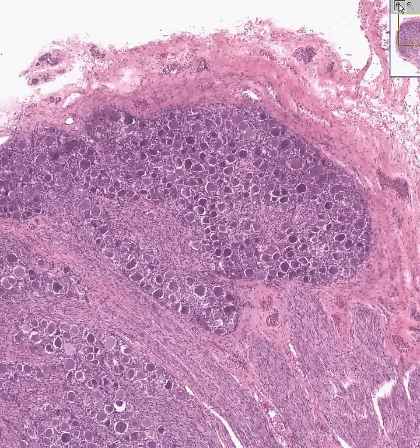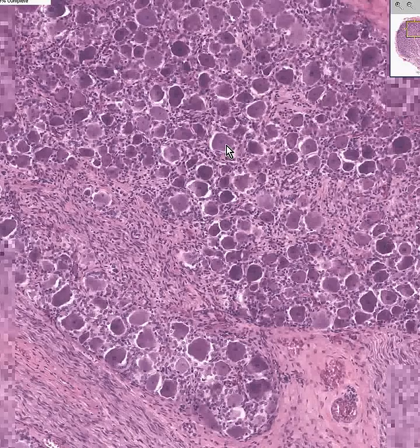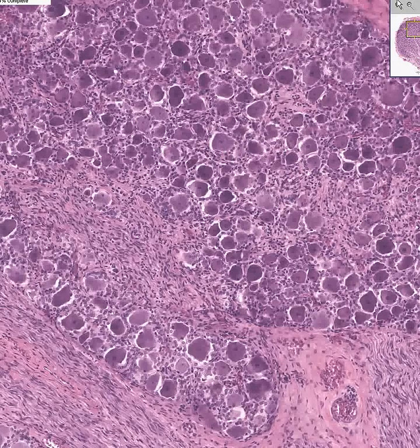The dorsal root ganglion has two kinds of cells. It has these big neurons with big nuclei and big nucleoli, and they're surrounded by smaller, protective cells called satellite cells, which protect these neurons like glial cells do. And then we have the actual neurons — they are pseudo-unipolar neurons.